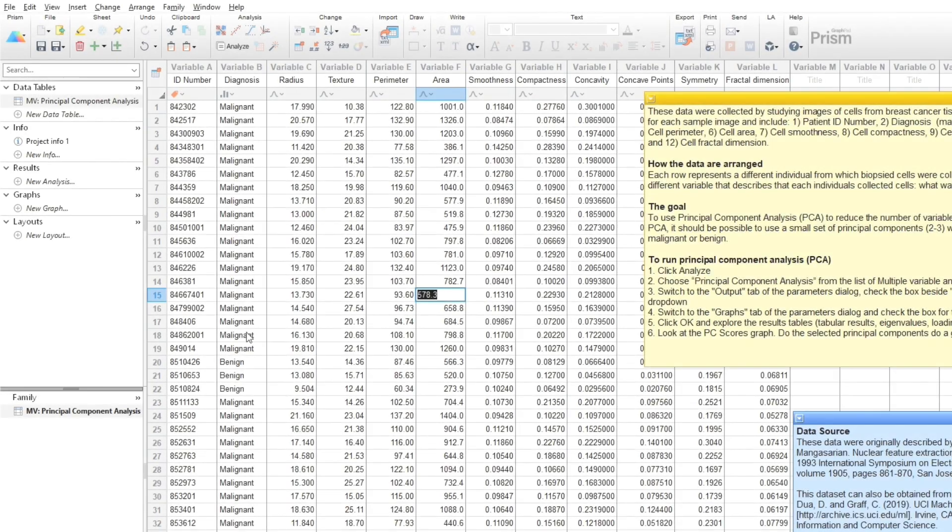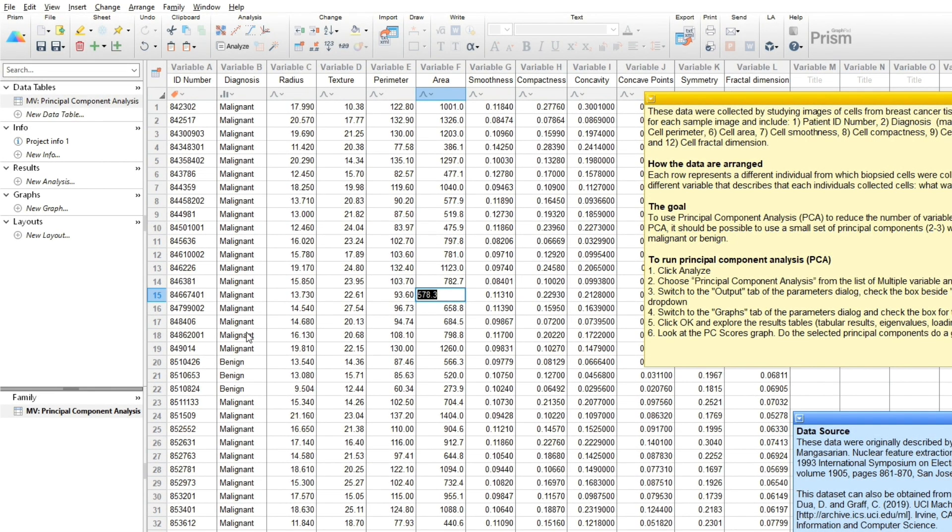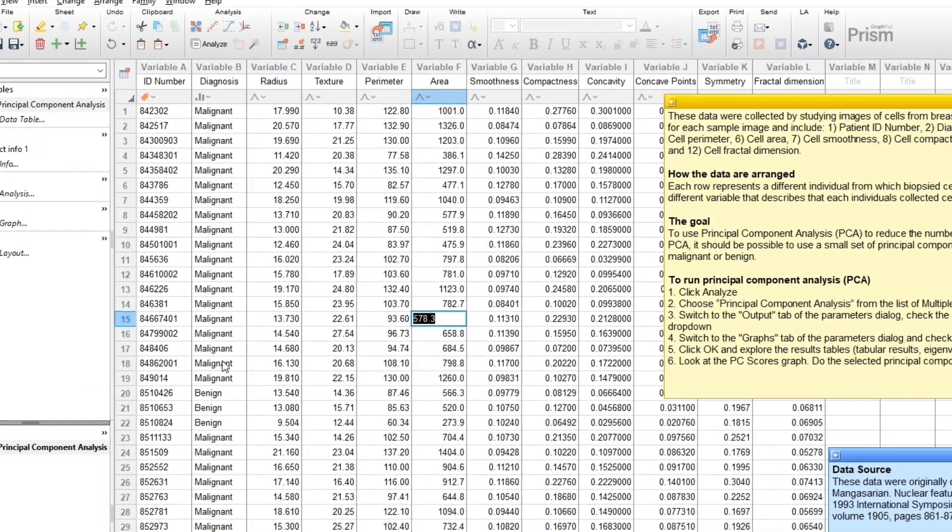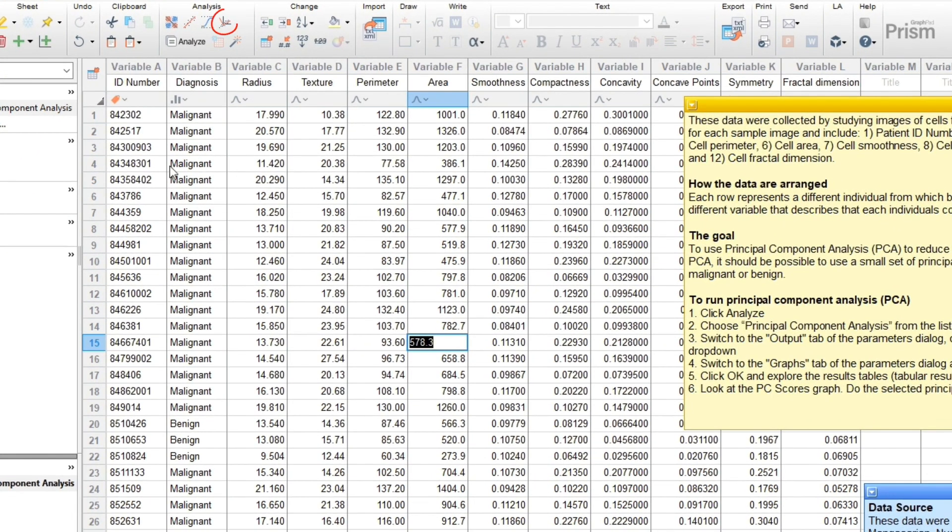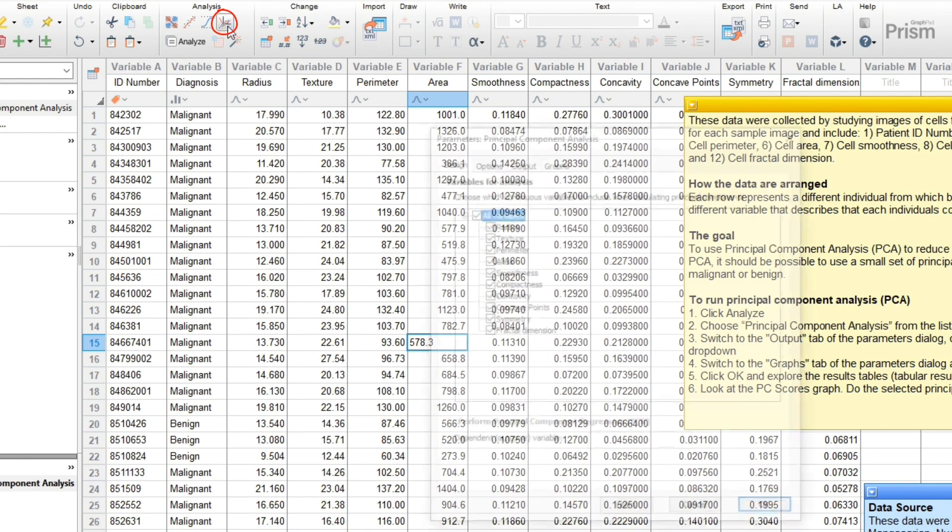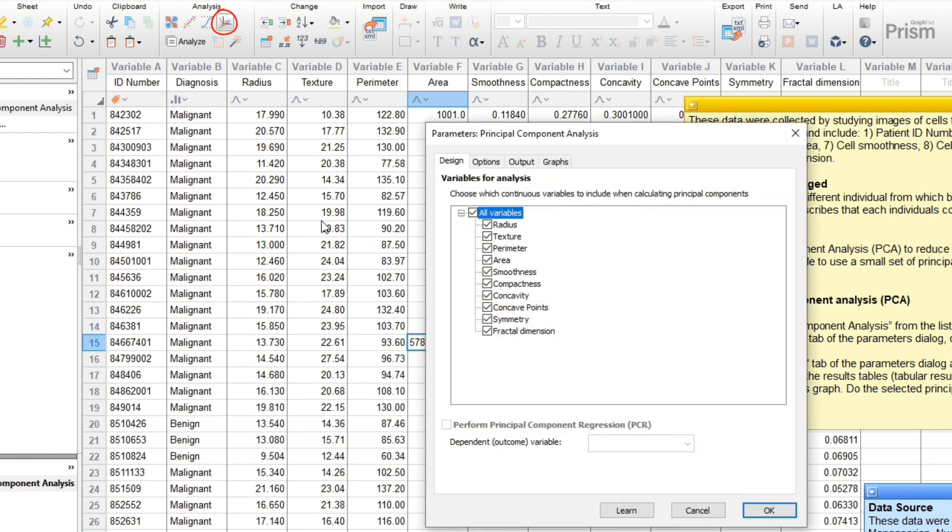Running PCA in PRISM is straightforward. To start, you'll need your data in a multiple variables table. There's an icon to launch principal components analysis, or you can select it from the Analyze menu. In the first tab, you'll select the variables that you want to include in PCA. Only continuous variables can be selected as predictors.